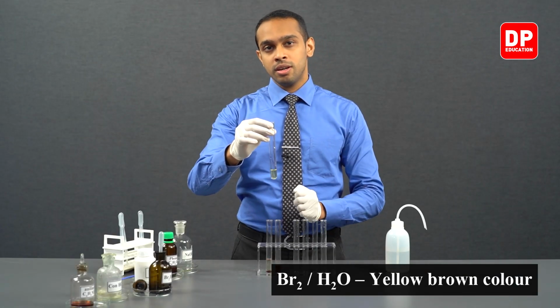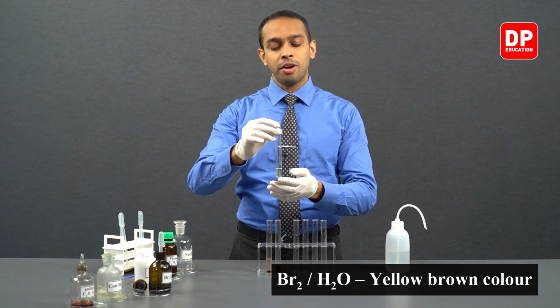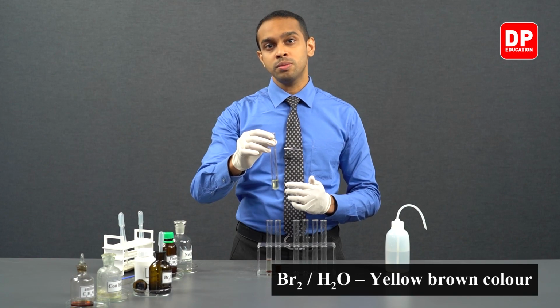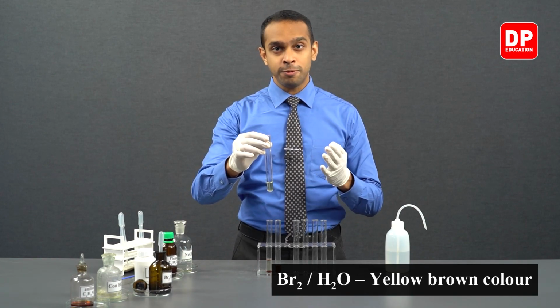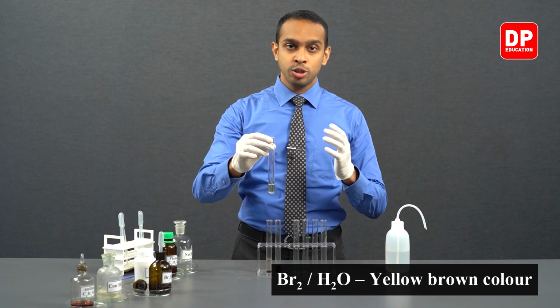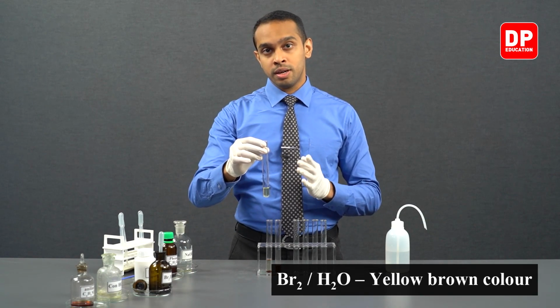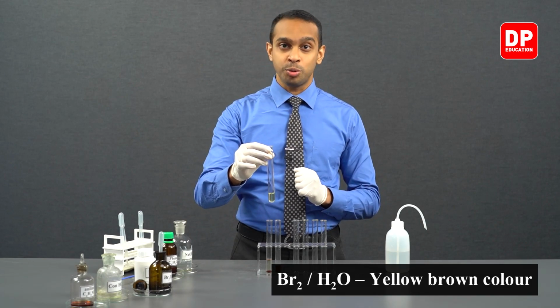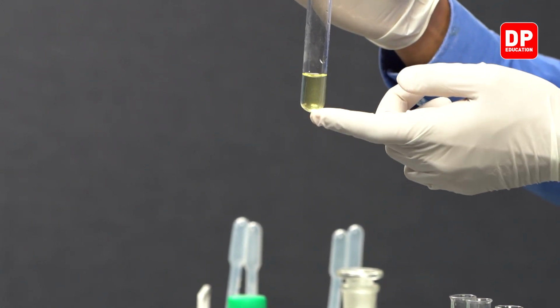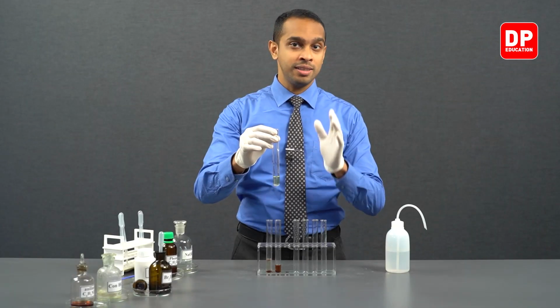However, if this bromine water shows a reaction with aniline, the color of the bromine water should disappear. Aniline, just like phenol, activates the benzene ring. So therefore, it readily reacts with bromine water. Just like phenol, aniline also forms a white precipitate after reacting with our bromine water. So you will see the color of the bromine water disappearing as well as formation of a white precipitate.